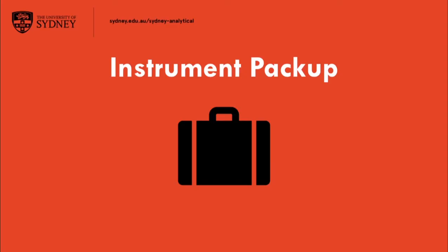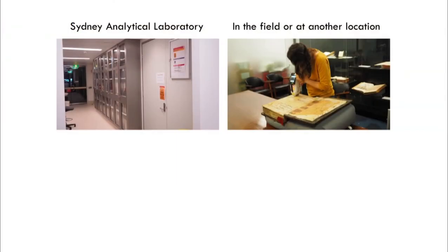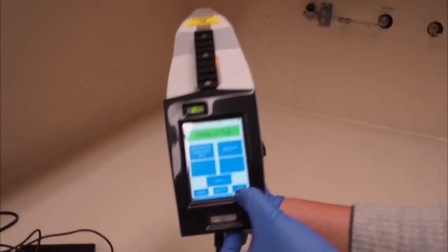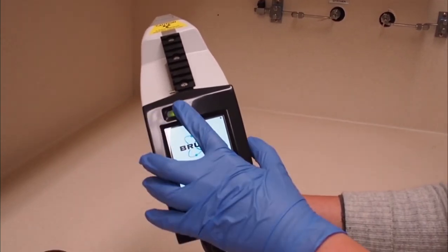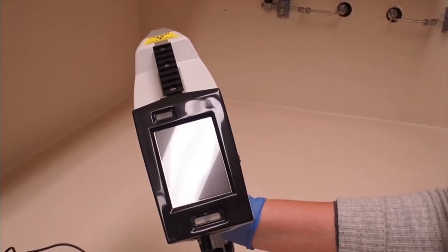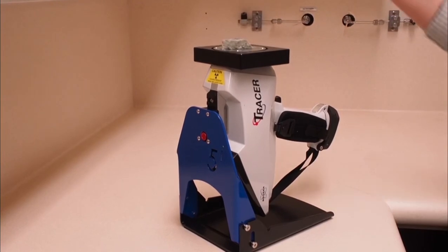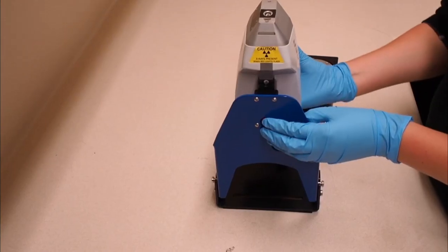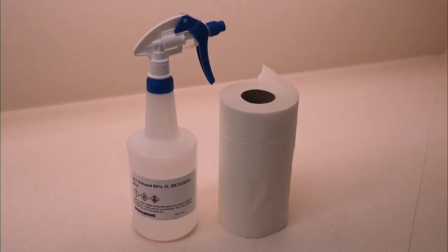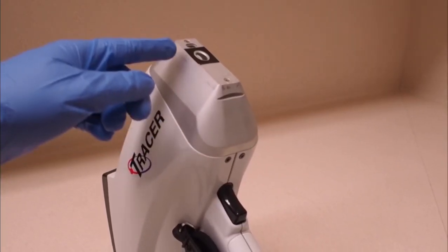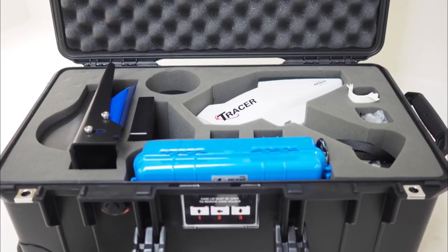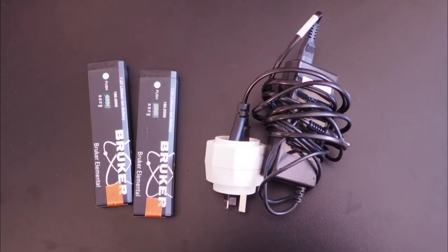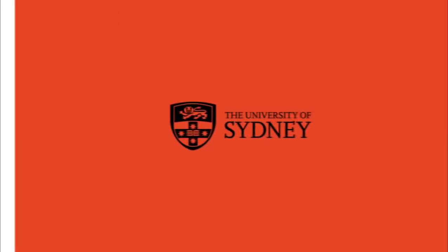Instrument pack up. Whether the tracer is used in the XRF lab or at another location, the instrument needs to be returned to its case. After completion of all your measurements, turn off the instrument by selecting log out in the menu and pressing the power button. Turn off the power pack at the power point and disconnect cables or remove batteries. Clean up your samples from on and around the stage, analysis window and benchtop and dispose of them correctly. Decontaminate surfaces by wiping with 80% ethanol if needed and make sure care is taken with the analysis window. Make sure that all accessories are returned to their proper place and the workspace is tidy. Remove any signage that has been put in place. Return the batteries or power pack and dosimeter to Sydney analytical staff and ensure you log the dosimeter reading.